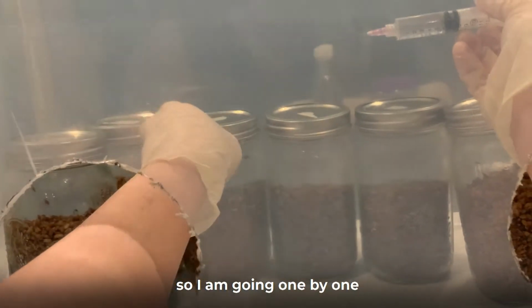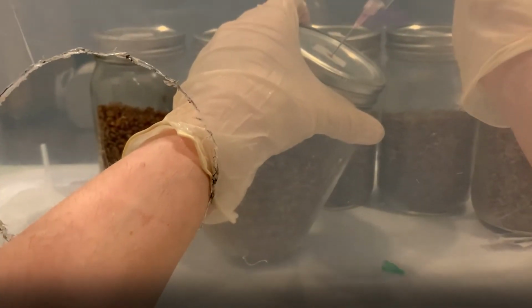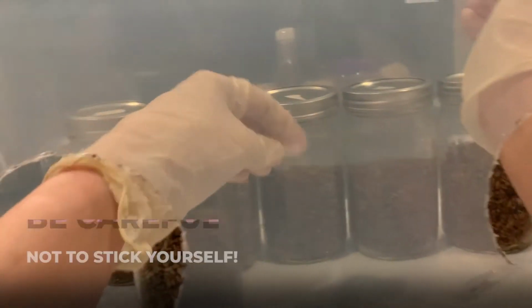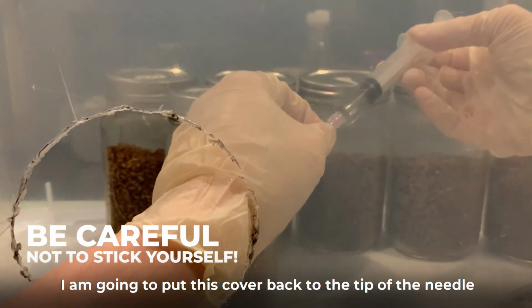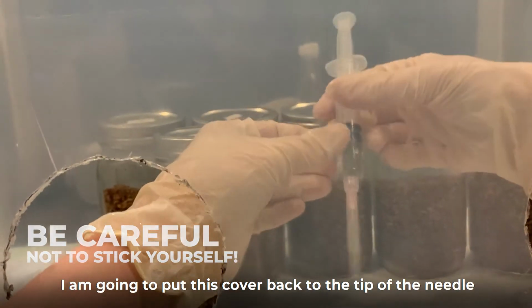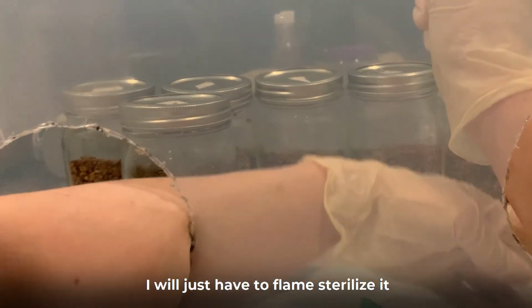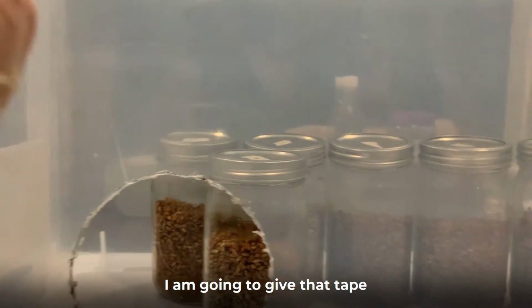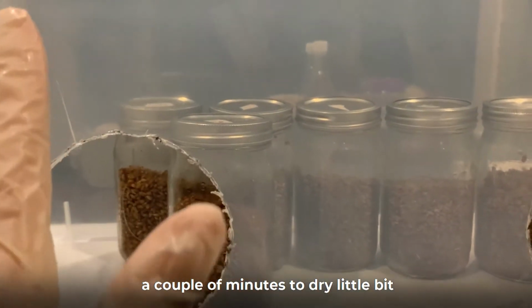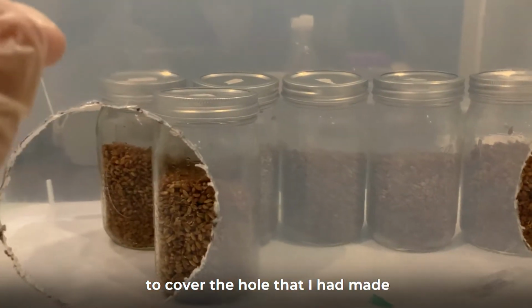So I'm going to go one by one. And then when I'm done, I'm going to put this cover back on the tip of the needle. I can reuse that needle if I want. I would just have to flame sterilize it. I'm going to give that tape a couple of minutes to dry a little bit and then put another piece of micropore tape to cover the hole that I made.